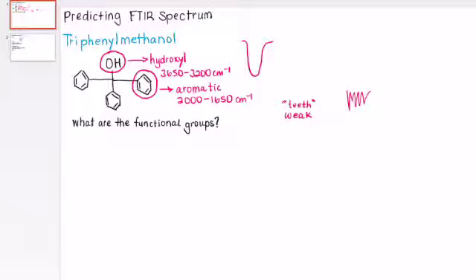This characterization technique is super important in order to determine the success of our separation, synthesis, whatever we're doing in lab, because we can compare the FTIR of our product and the functional groups of our product to that of the starting material or the desired product, whatever we want the outcome to be in lab. So hopefully this helped you, and if you have any questions, be sure to talk to your TAs.